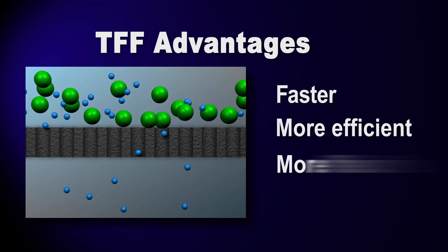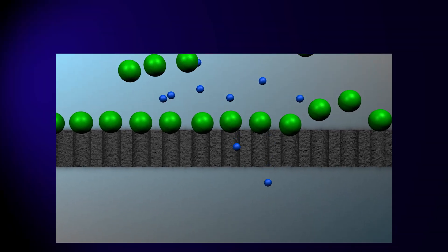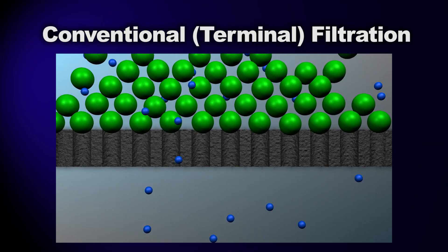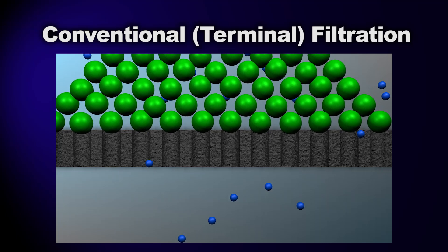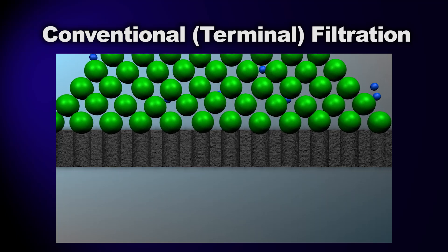In conventional filtration, a fluid is propelled directly into a filter. The particles within the stream that can't fit through the pores of the filter build up at the filter surface, eventually clogging it.